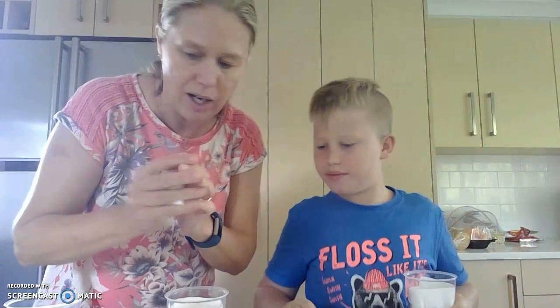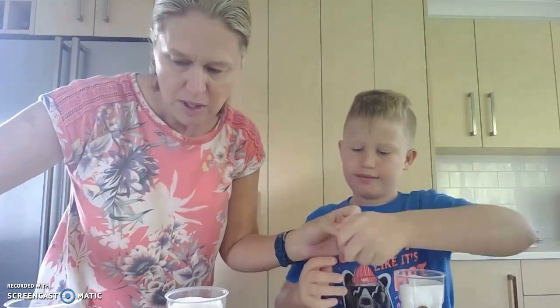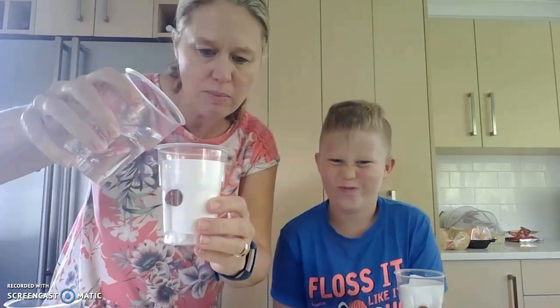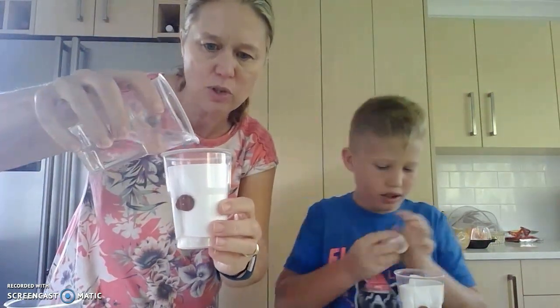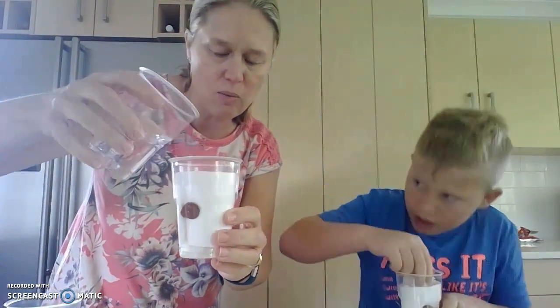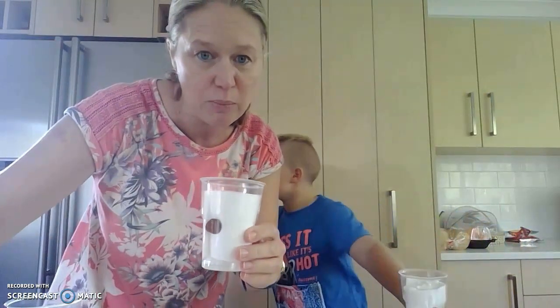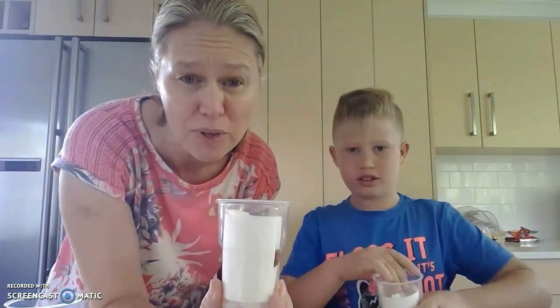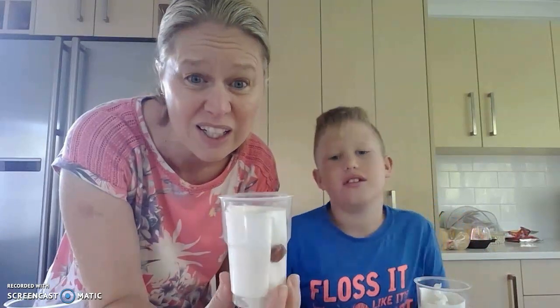And then once we've got our cup full, we're going to take a bit of water - we don't want too much water, but we want the paper towels soaked. Then we're going to put them in the cupboard to get them to start germinating. To germinate, all they need is a bit of warmth, a bit of oxygen, and a bit of water.